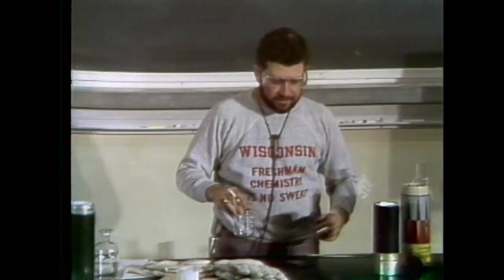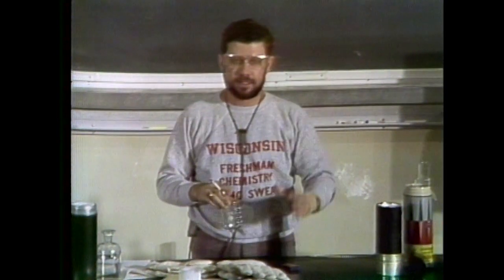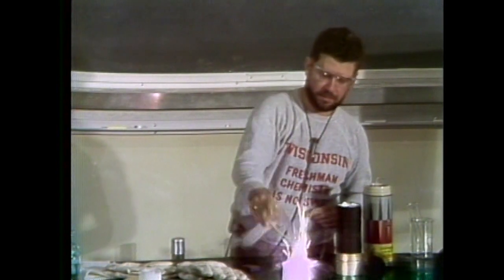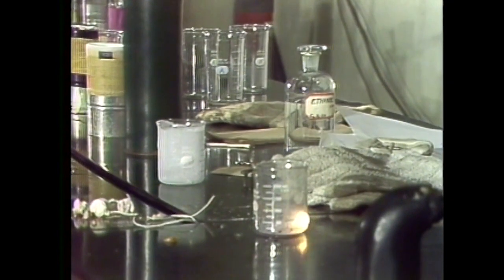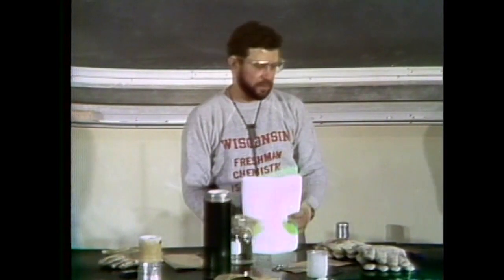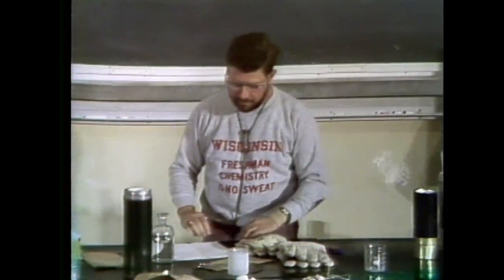Now, the concentration of oxygen here is approximately 700 times the concentration that we have in the air. And you see, one can use this concentration to, when I get done with my cigarette, just burn off all the ashes like this, and everything goes into the gaseous phase, and there's nothing left over to be picked up. Now, still going away.